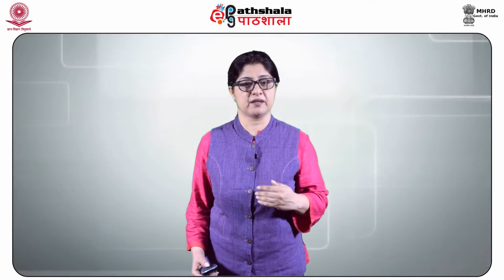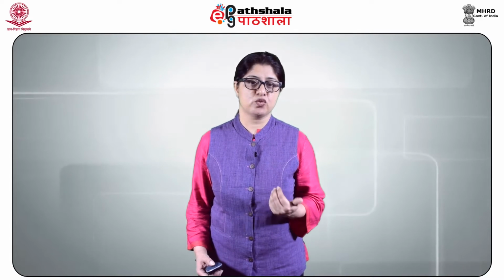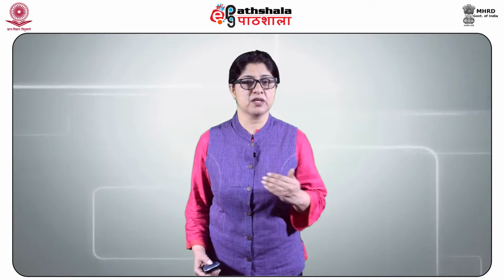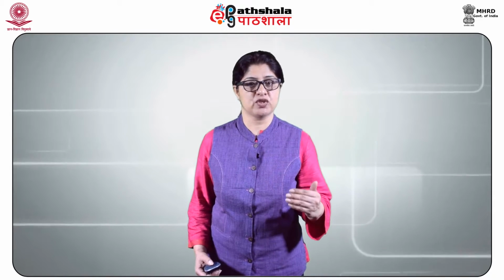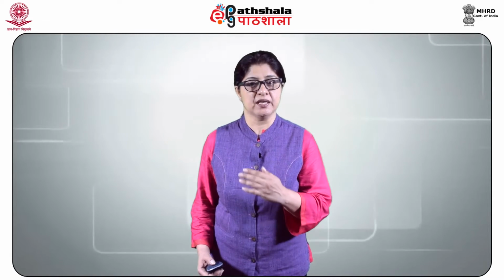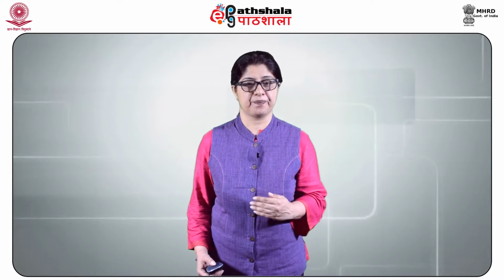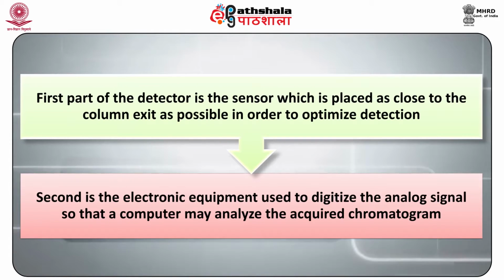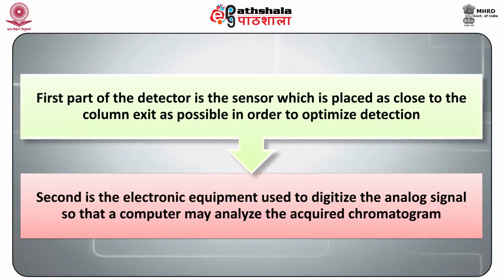Each detector has two main parts, which when used together serve as transducers to convert the detected property changes into the electrical signal that is recorded as chromatogram. The first part of the detector is the sensor, which is placed as close to the column exit as possible in order to optimize the detection.